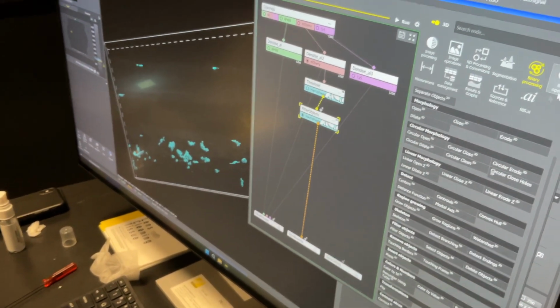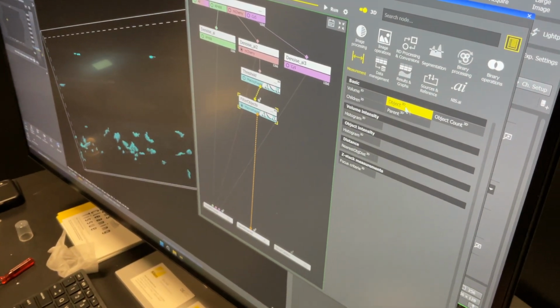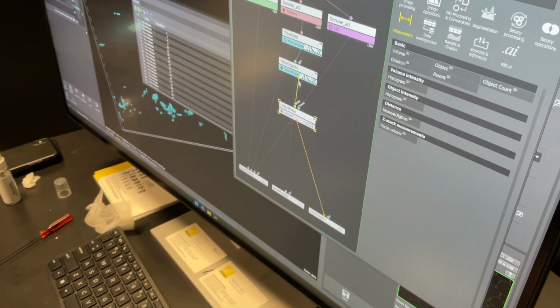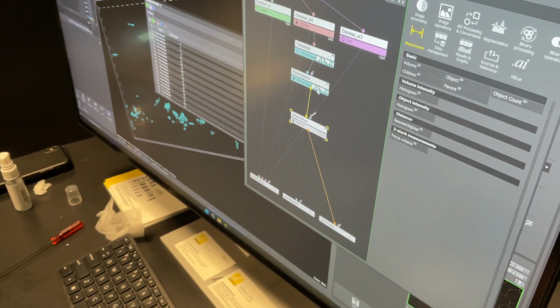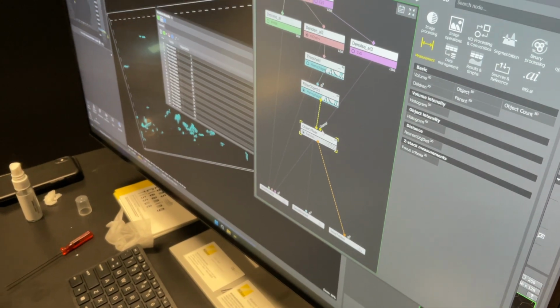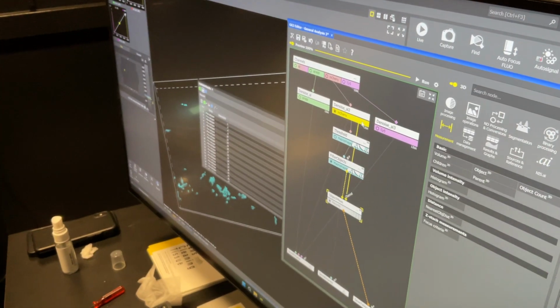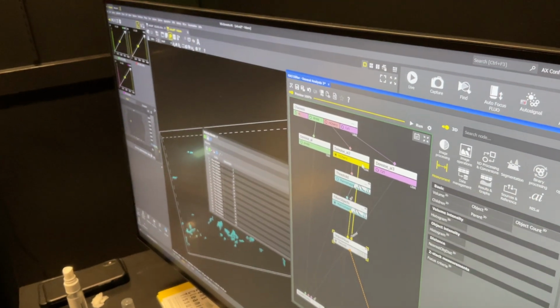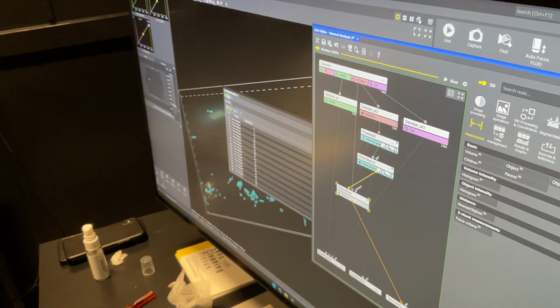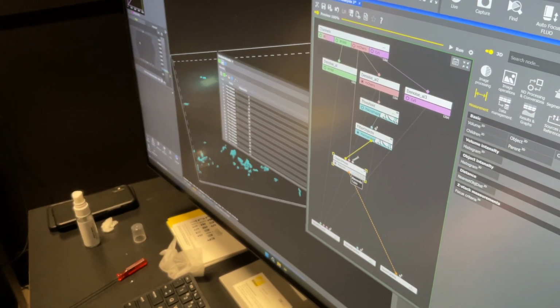Okay, so we're gonna step over to measurement, and in this case, we're gonna measure a 3D object. So I'm gonna drop that right on here. And you see that automatically links to the layer that we built, but it's looking for a channel. Here it actually says channel, which is nice. So I'm gonna now measure data. But wait a second, if I go back here, I've changed my data, right? I can go all the way back to the raw channel. So this is why it doesn't really matter. All your pre-processing steps to get your layer doesn't affect your raw data.